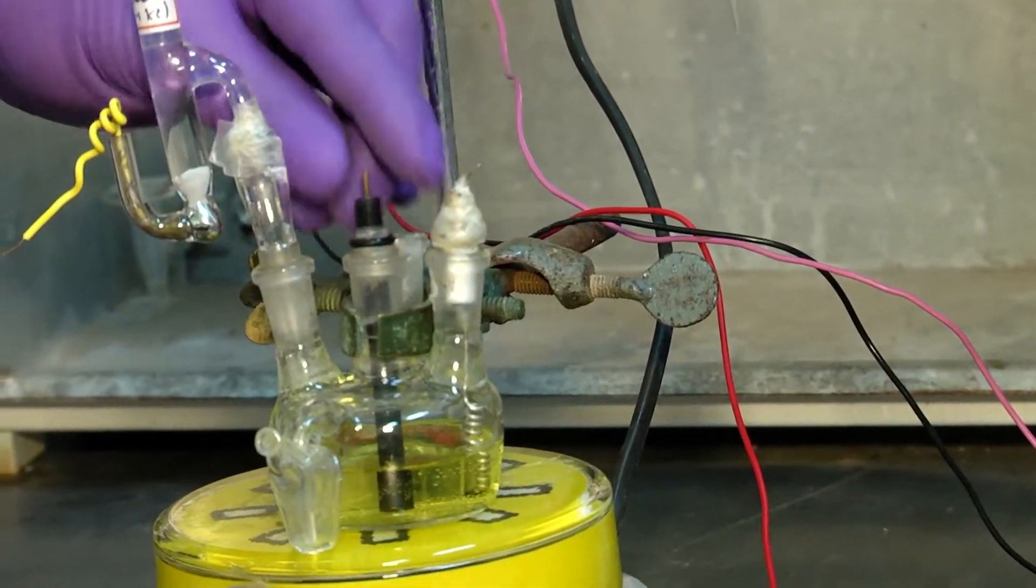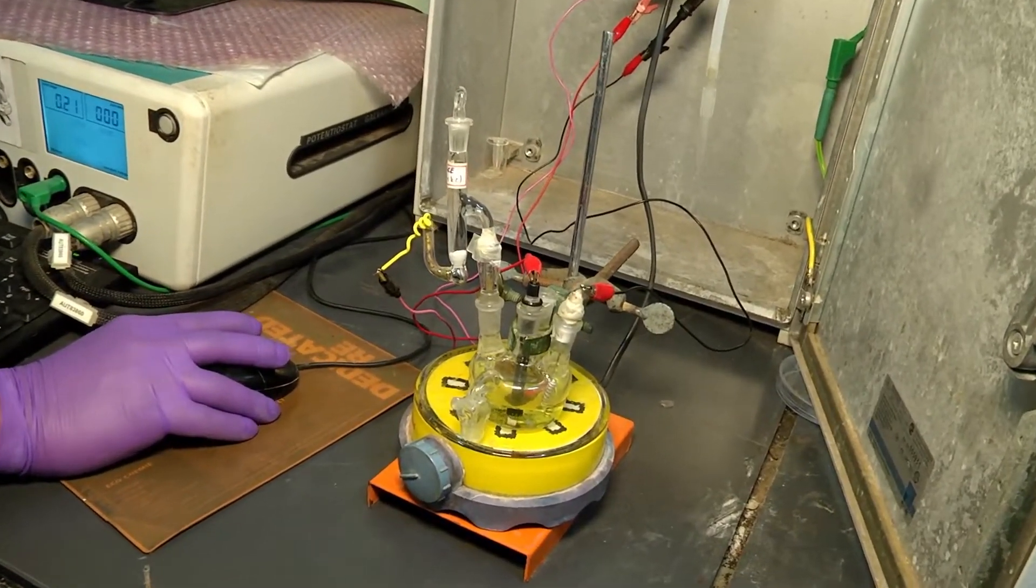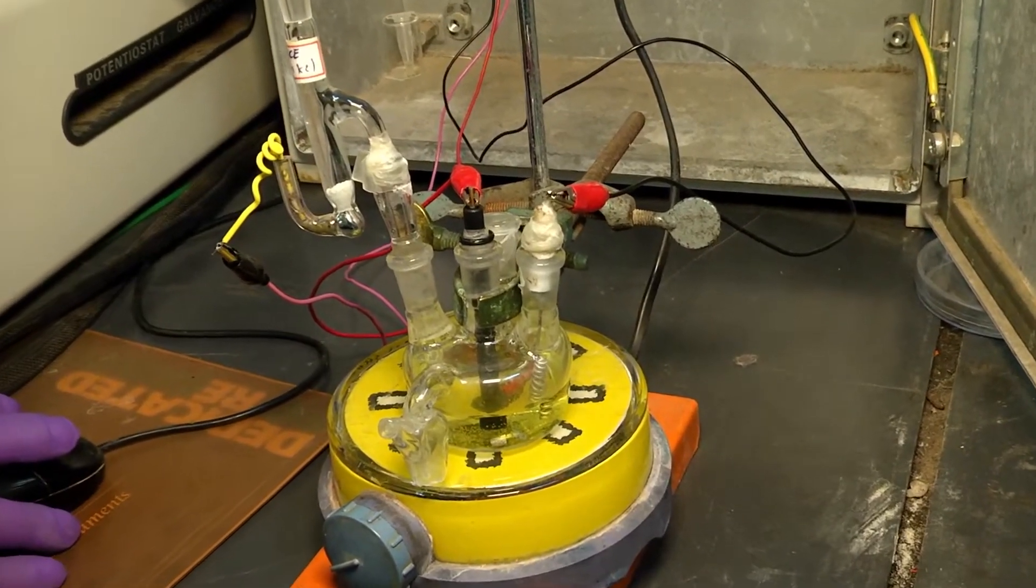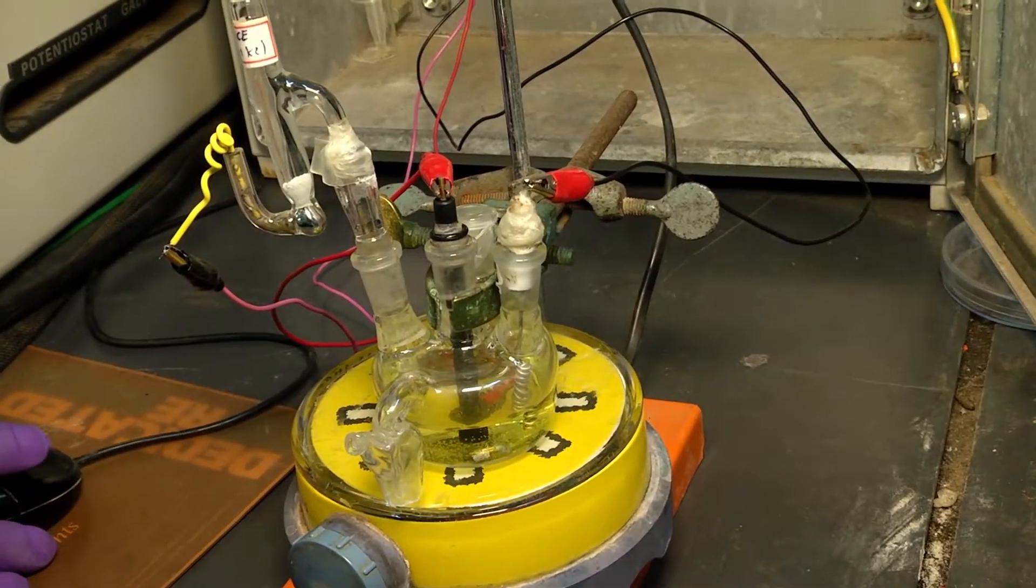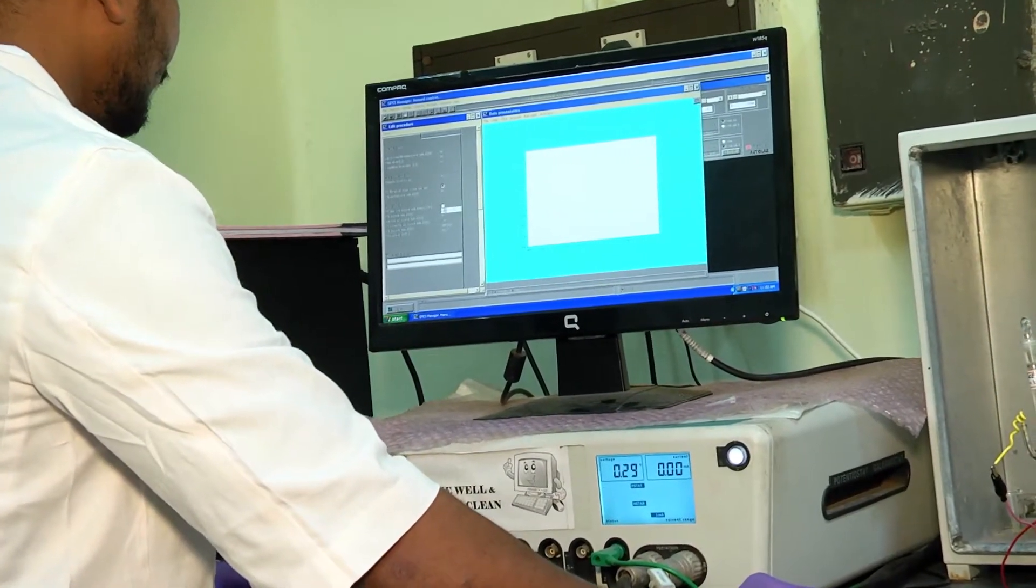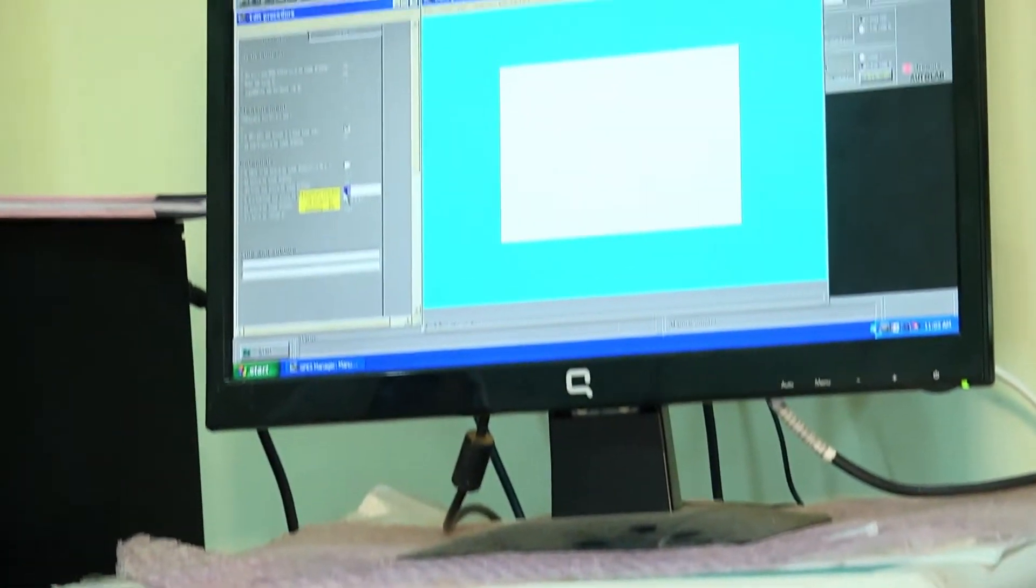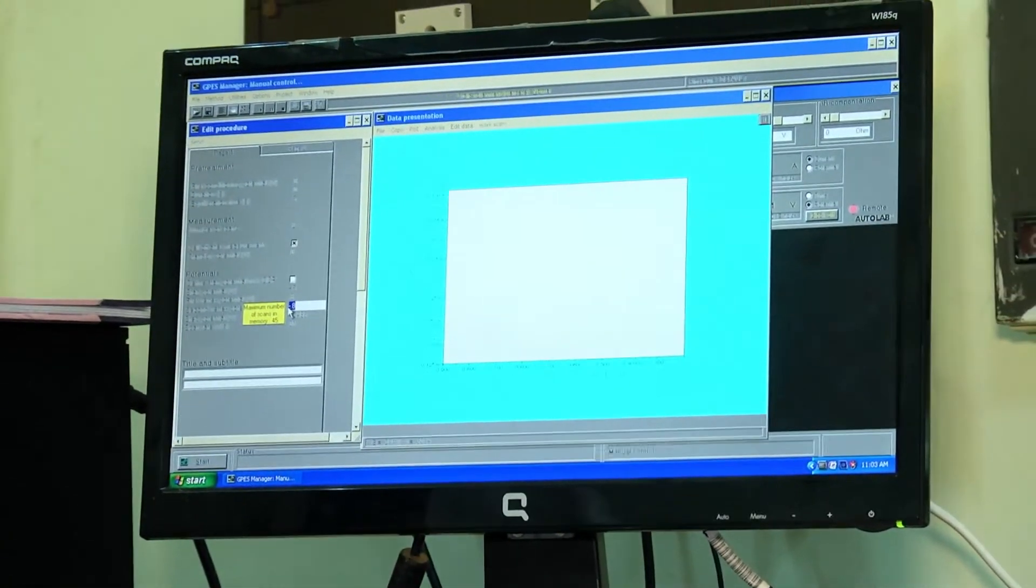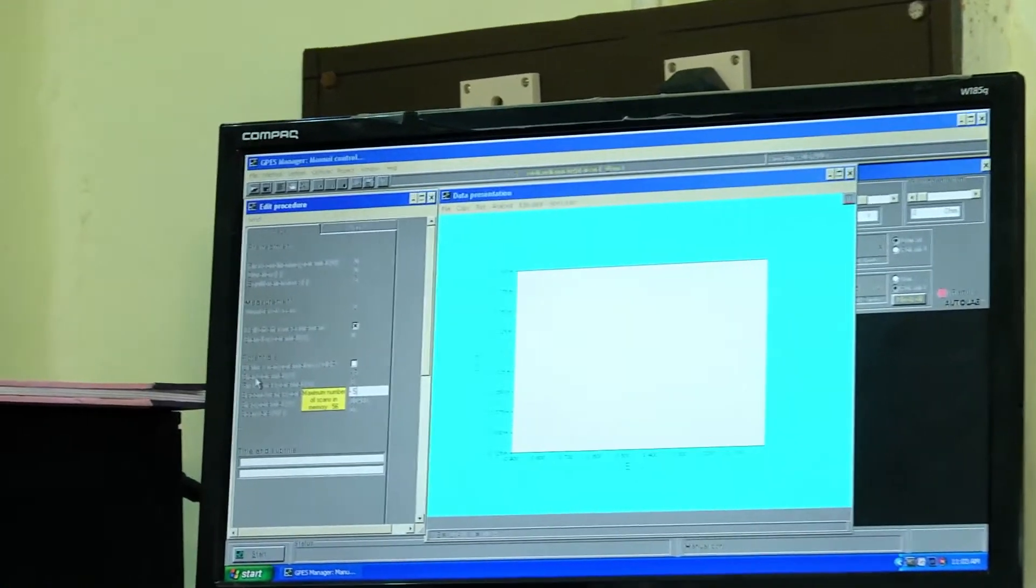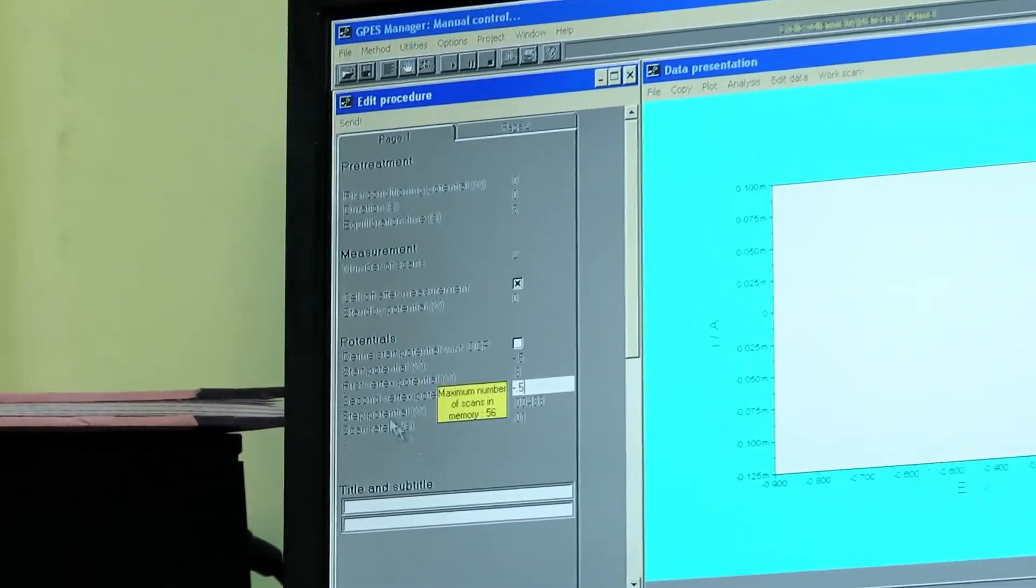The electrolyte consists of 5 millimolar potassium ferricyanide solution along with 0.1 molar KCl as a supporting electrolyte. CVs are recorded using autolab instrument within the potential range between minus 0.5 volt and 0.8 volt versus saturated calomel electrode at a fixed sweep rate of 50 millivolt per second.